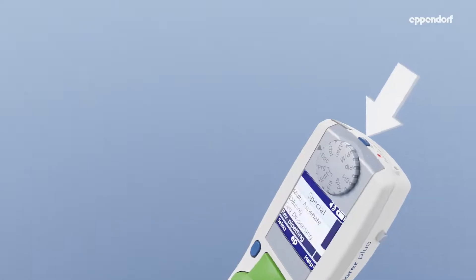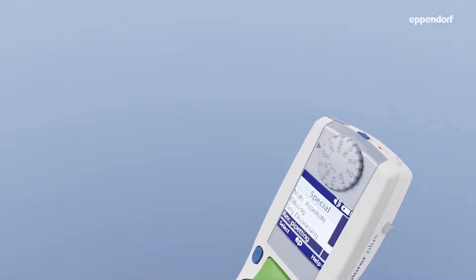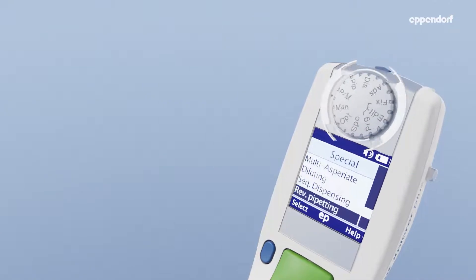Hold the power button to turn on your pipette. Turn the wheel to PM to select pipetting plus mixing mode.